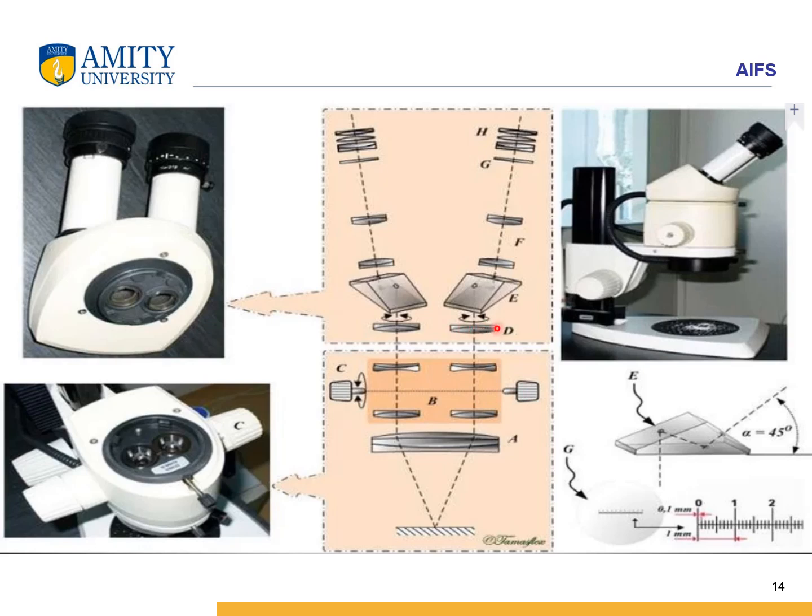This lens is present inside here. Okay, so this lens is next to the B portion. This lens is the internal objective lens. The internal objective lens is somewhere here. And when we go beyond it, you can see there is a prism-like structure which is housed in the head, below the eyepieces in the head.